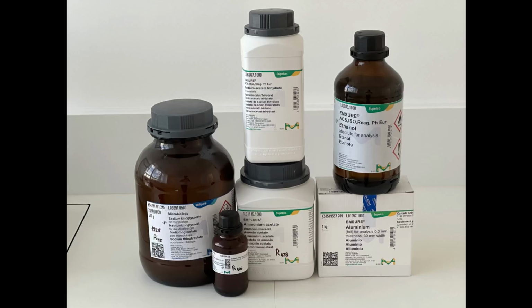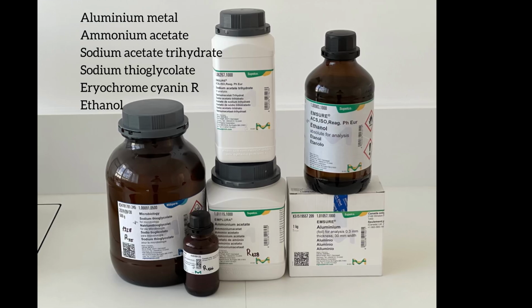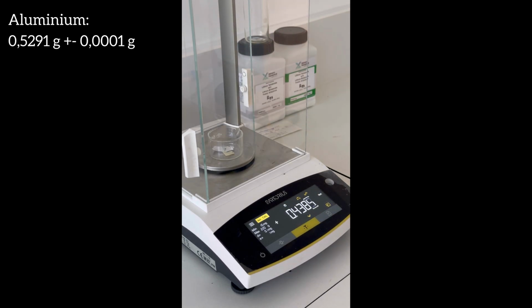For this preparation, we will need the following reagents: aluminium metal, ammonium acetate, sodium acetate trihydrate, sodium thioglycolate, Eriochrome cyanine R indicator, and absolute ethanol. We begin by weighing 0.5291 grams of the aluminium metal. Care must be taken to be as accurate as possible, with deviation of plus or minus 0.1 milligram.